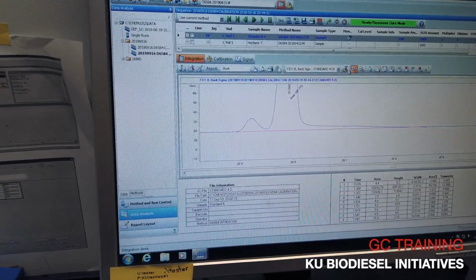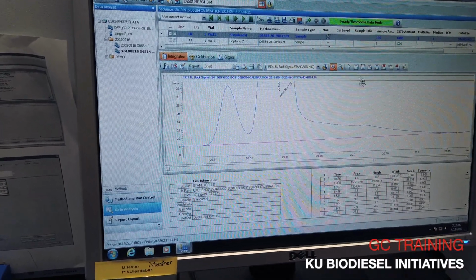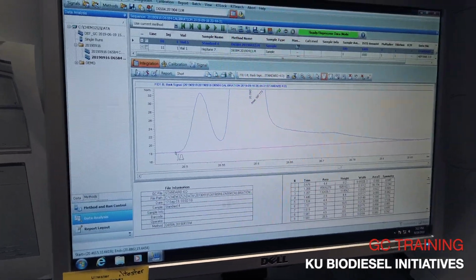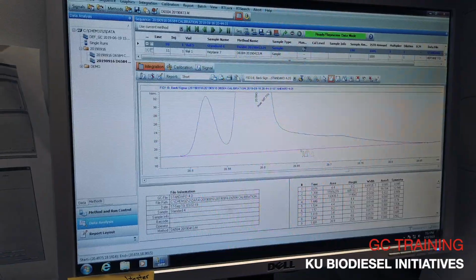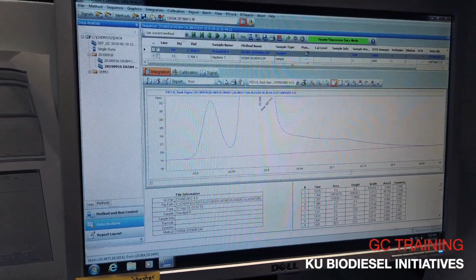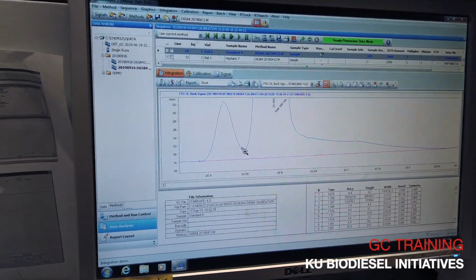So would you recommend going through and getting the start and stop times first and then integrating? Yeah, that's what I would recommend, but I'm going to just go through this and see, and then I'm going to overlay them again afterwards through the signal and see if those numbers still made sense.